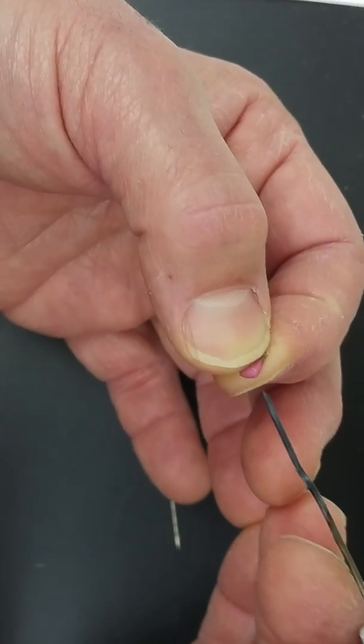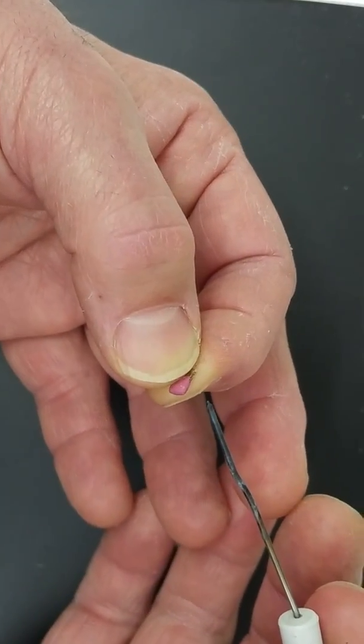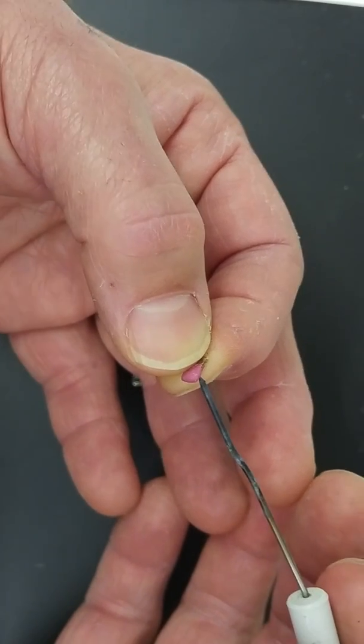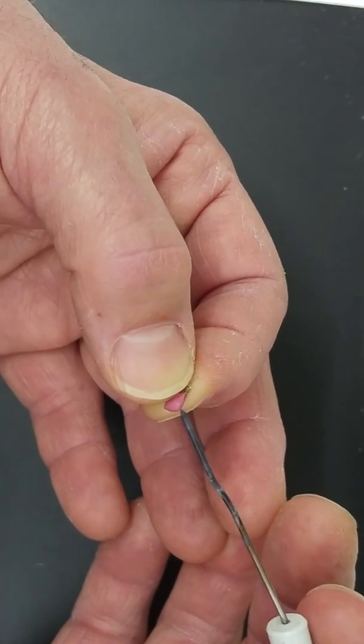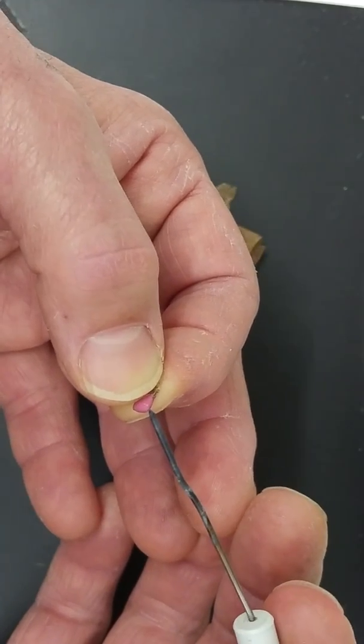Now there might be one or two students in this class that don't particularly want a finger infection. So if you're uninterested in the finger infection, I have a different technique to successfully get the match on the pin head. Though for the life of me I can't see why you might not want a finger infection. So I'll show you the next step.